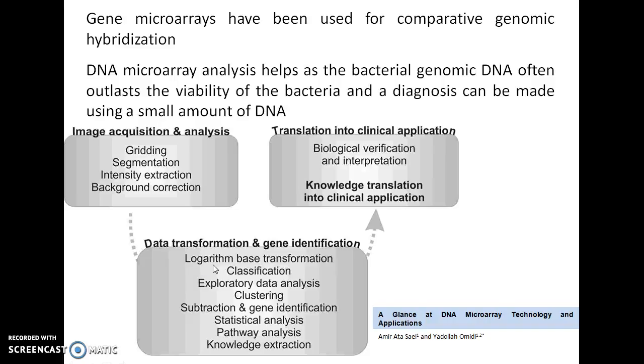Where the map is, the collected microarray images are compared with the other images that are collected from different samples. So this is the method.